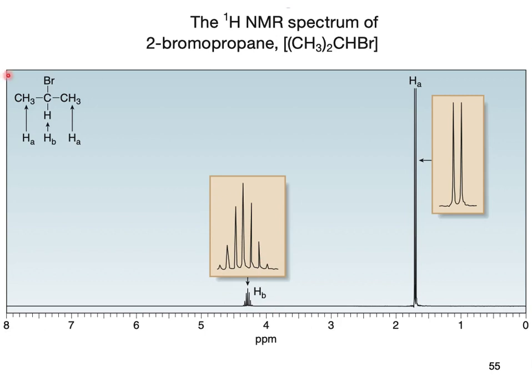This is a septet. And then the methyl gives the information about its own environment, that I am attached to a shielded proton, right? My chemical shift is this one, but nearby I have only one proton. One plus one, two. These both protons have the same chemical environment. So 1 plus 1, 2, a doublet. So this one is a doublet.